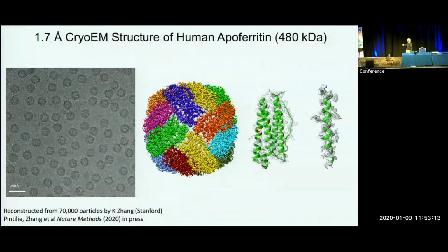And then there's a 4 helix bundle, and it looks quite nice. The aromatic rings look like an American donut, and at a lower resolution, they look like a pancake you ate this morning. So this was done in our lab. One of the questions that was curious to me is, since this is a technology that has now become very popular and is in high demand, can different labs using different instruments and different software generate the same quality map? It turned out that last year a few labs used this apoferritin, whose crystal structure is known, and they did it independently.